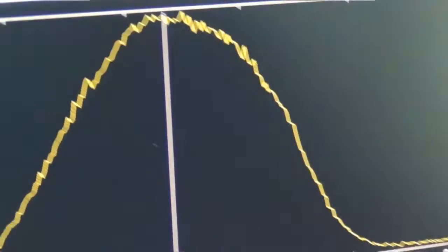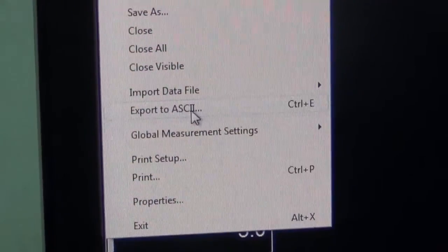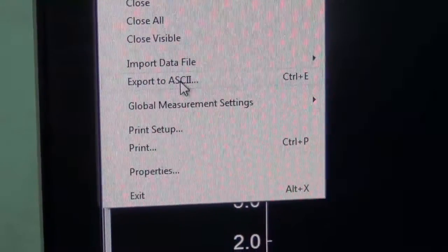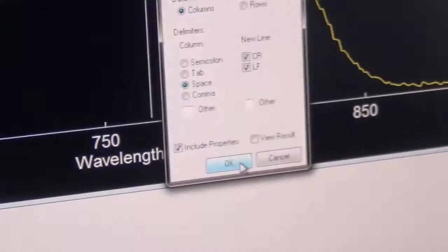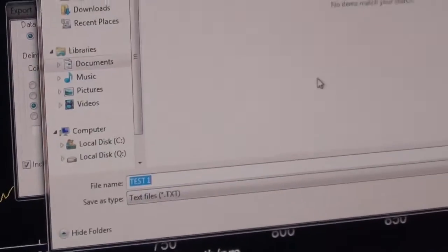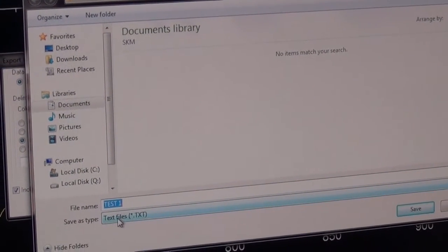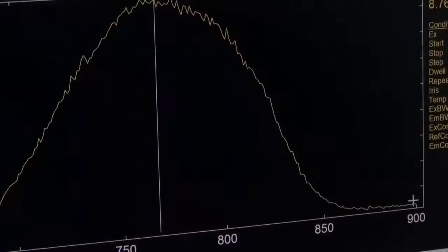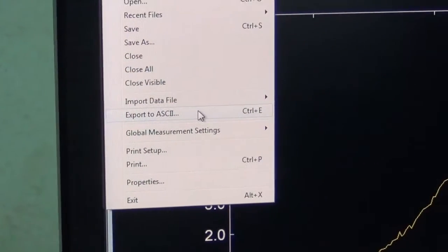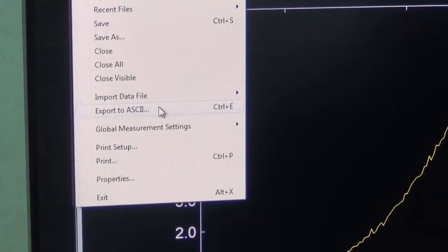And the second thing that you need to do is click save, Export to ASCII. I don't know the correct pronunciation; I just pronounce it as ASCII. Click it. One pop-up will come out. Just click OK. A new pop-up will come out with your folder, and just let it be test 1 and save as text file. Save it. Now the importance of saving or exporting into ASCII is that that file will be used to be opened in Microsoft Excel.